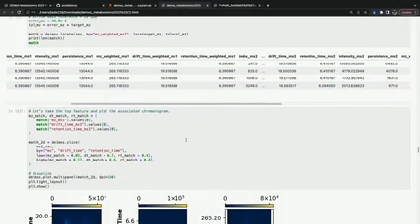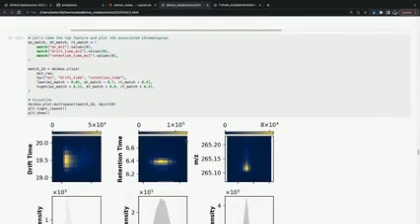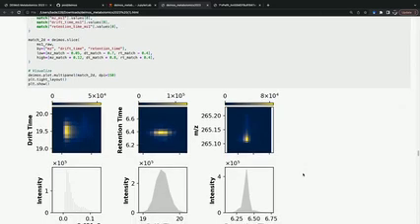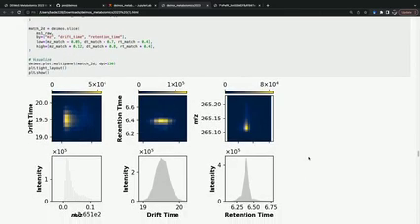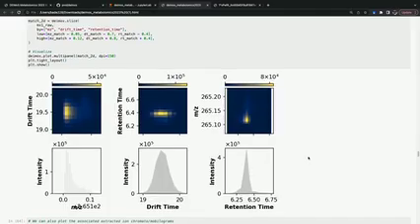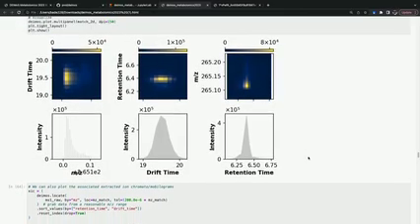We're just going to reproduce some of the steps we saw above. We want to look at this feature and its associated chromatogram in 2D and 1D space. So what does this look like? Sometimes chemists can immediately tell when a feature is junk just by looking at its peak here. But these look like fairly well-resolved peaks of a pretty high intensity in each dimension.